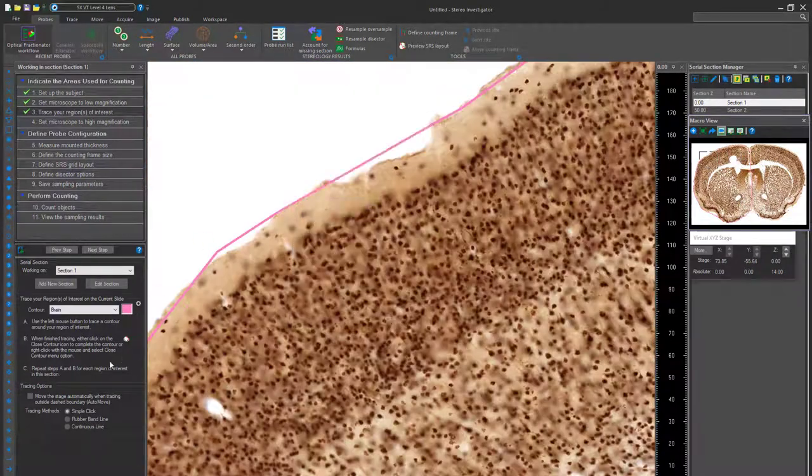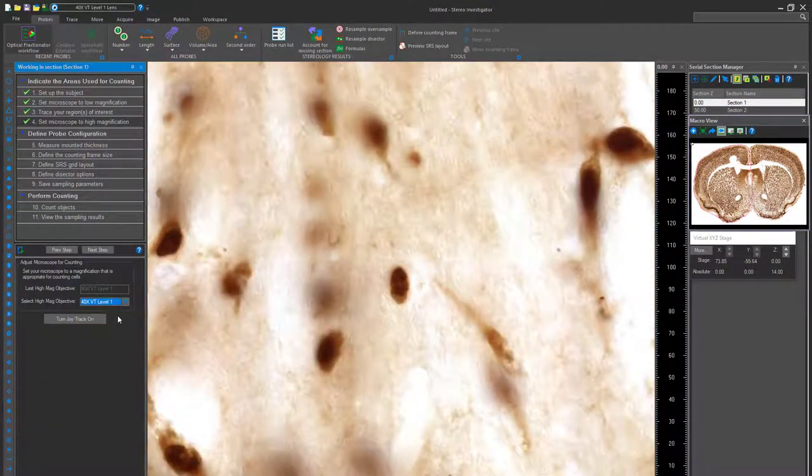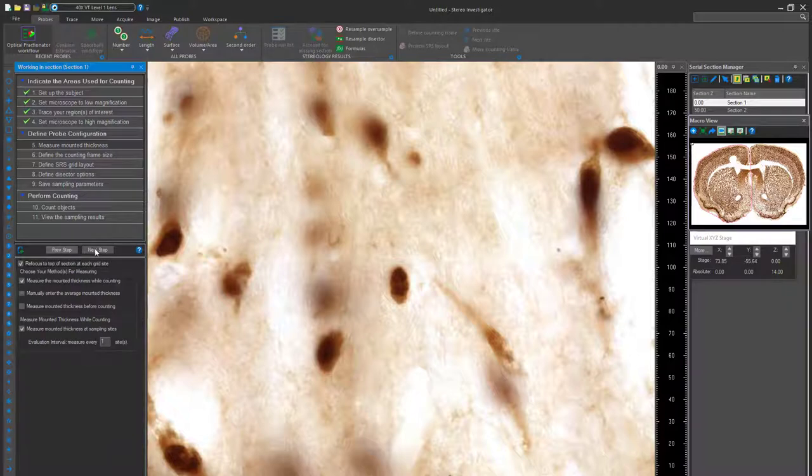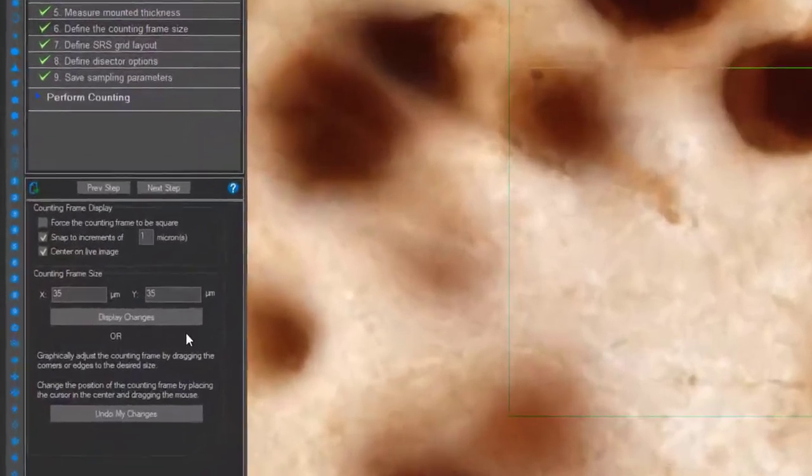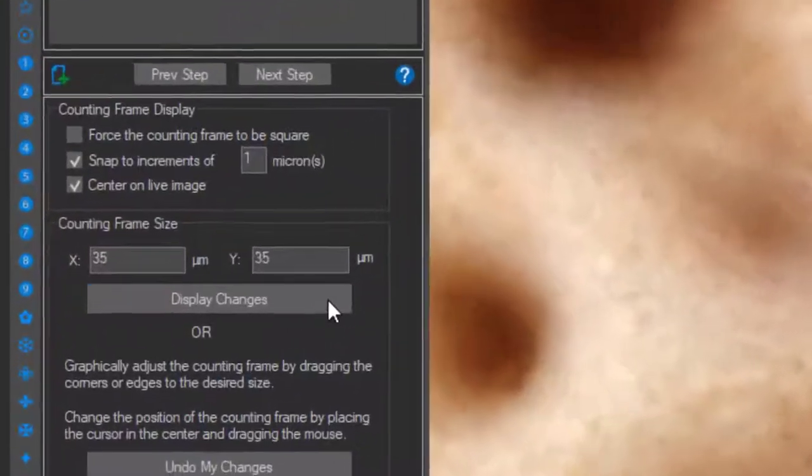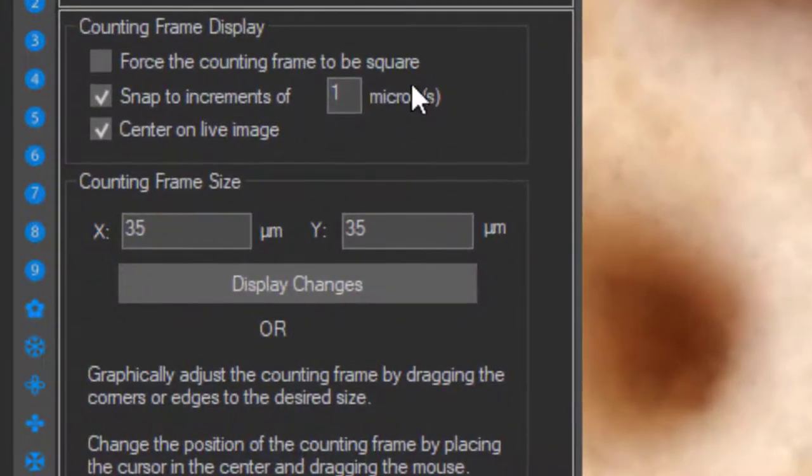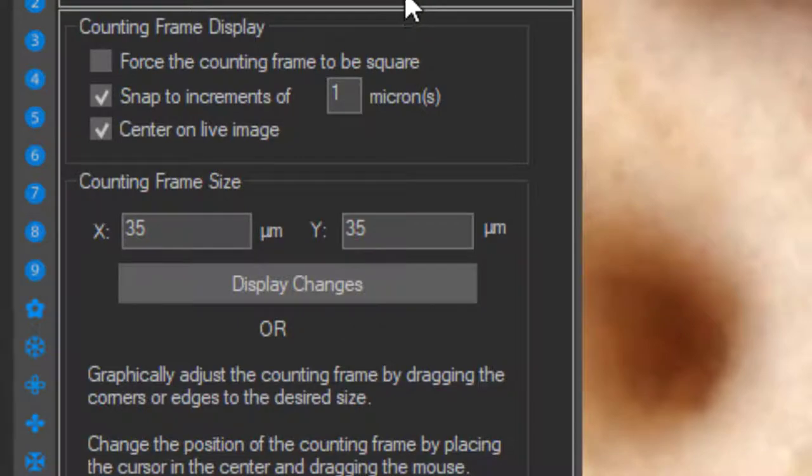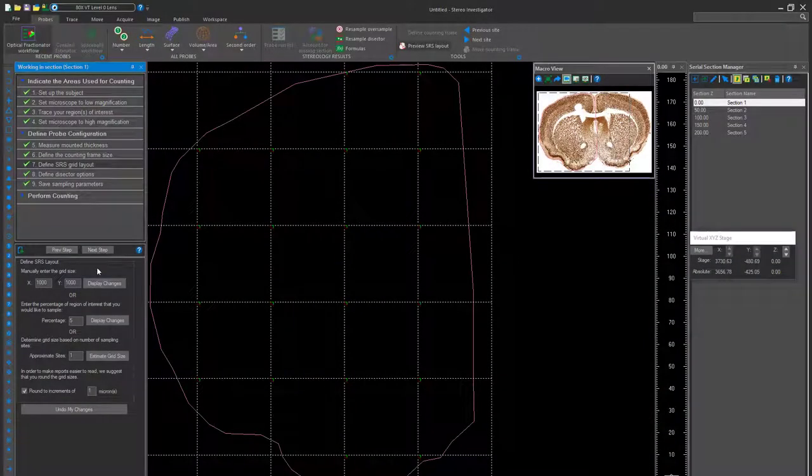Once that's completed, set your microscope to high magnification and move on to configuring the probe. Once your areas of interest are defined, it's time to set the dissector size. You may have a predetermined dissector size depending on your research. Determine the correct size for the research you are conducting and then move on to defining the grid layout.